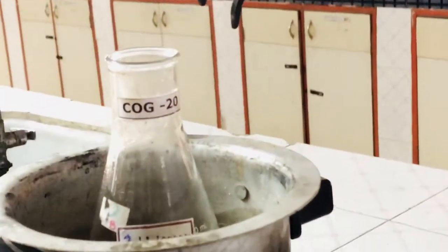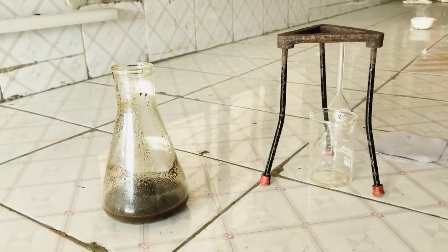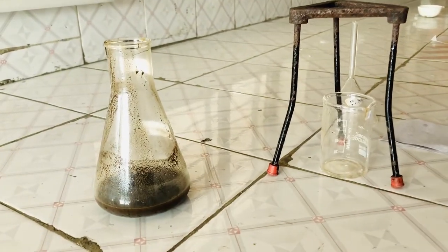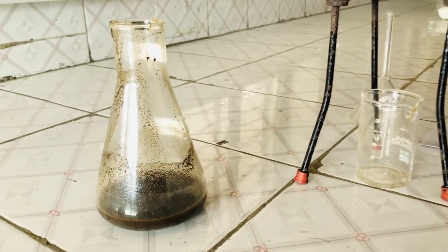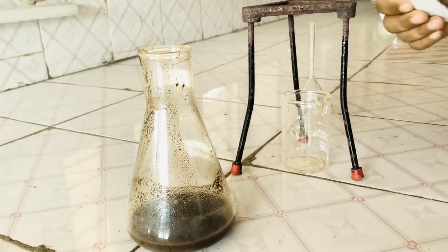Since it has been 30 minutes we would remove this for further process. Now the contents of the conical flask have cooled down. So we will filter the contents of the conical flask through the filter paper. Let's set the assembly.